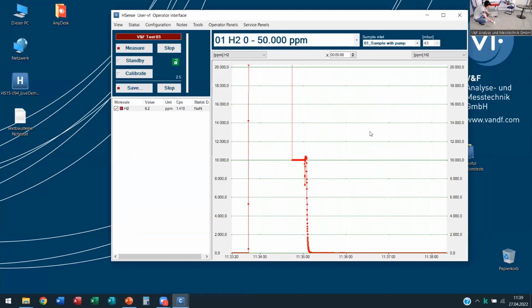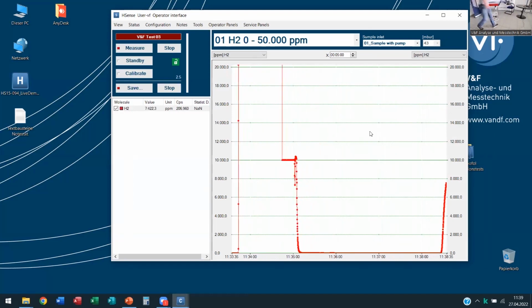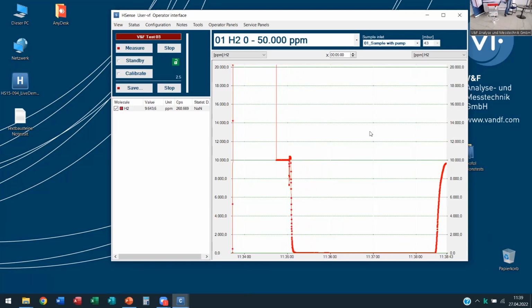I'm going to open one of these needle valves right now. The gas flow through these valves is rather low, and the volume in this chamber is about 1/2 liter, so don't worry about the slower response times. This is mainly because the real hydrogen concentration is actually rising slowly. It's not an issue of the instrument, it's an issue of the measurement chamber.